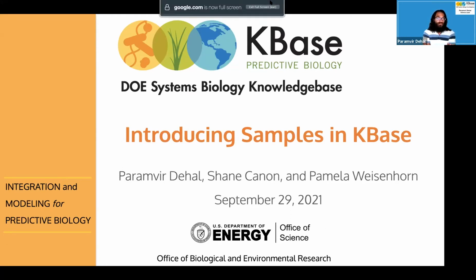So for today, what we want to do is introduce our new samples framework that we've added to KBase. The purpose of this webinar is just to get the introduction out so that you understand what we're building, why it's useful, and why we built it. Then we'll have a series of follow-up webinars that go into a lot more detail of exactly how to add your data to KBase, add your sample information to KBase, link your data and your analysis to samples, and then how to share all of that and use it in your work.